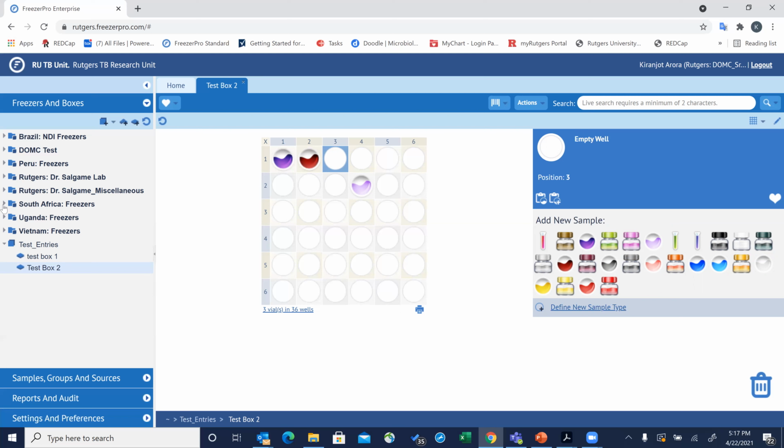You would be doing that for different samples once you receive physical samples for different participants for different studies. So you'll have pre-printed labels, you'll apply them to the tubes, and then you will write in the source document the barcode, or if you have already printed the labels for barcodes, you'll put that in the source document, and then scan and move the samples from the freezer or printed label station to the actual freezer. All right, so we covered that.